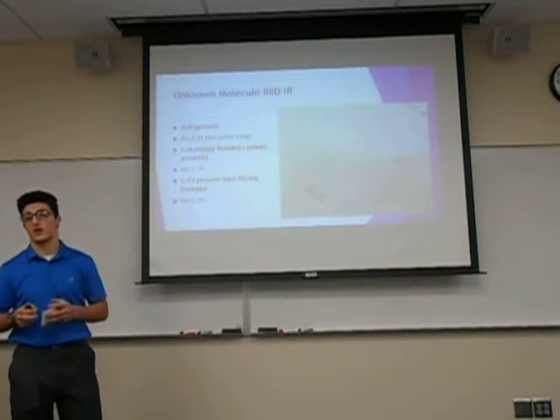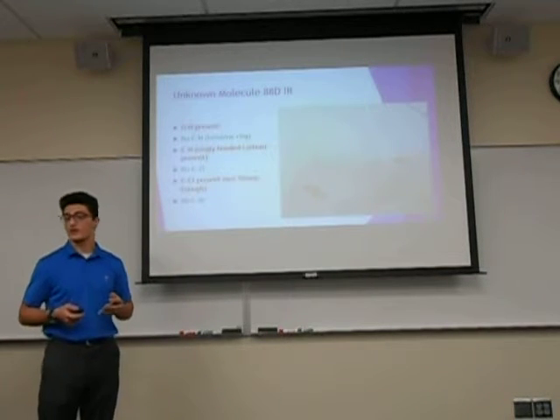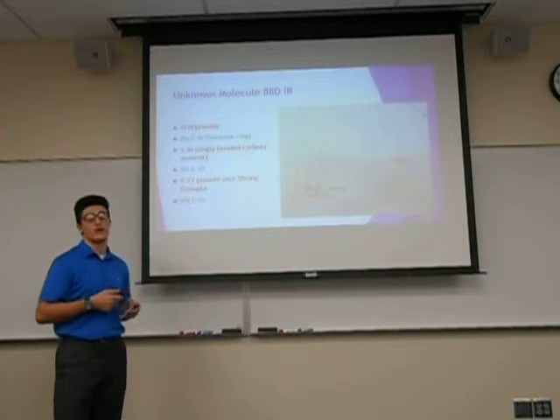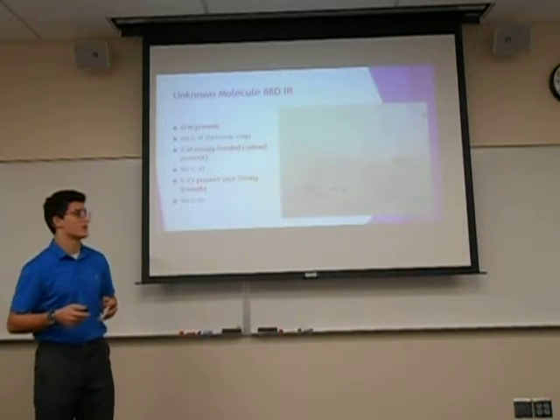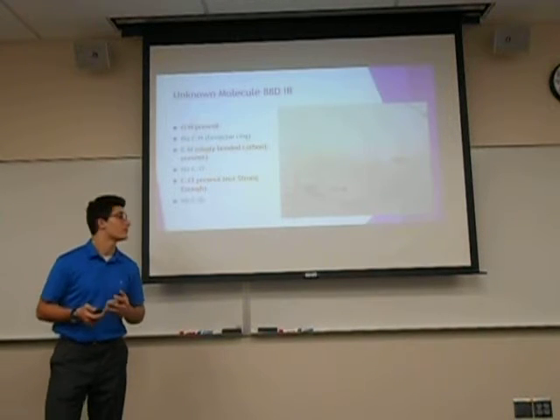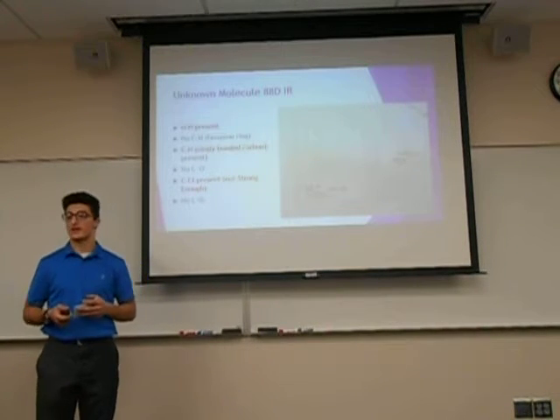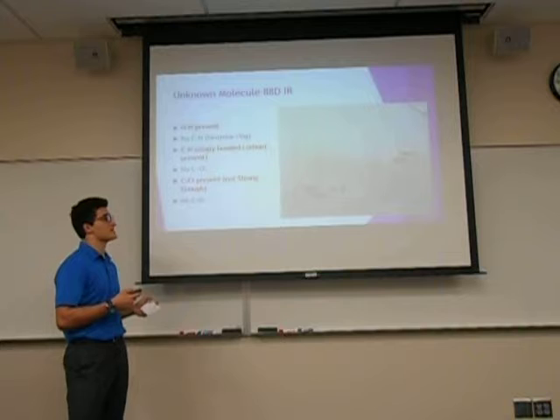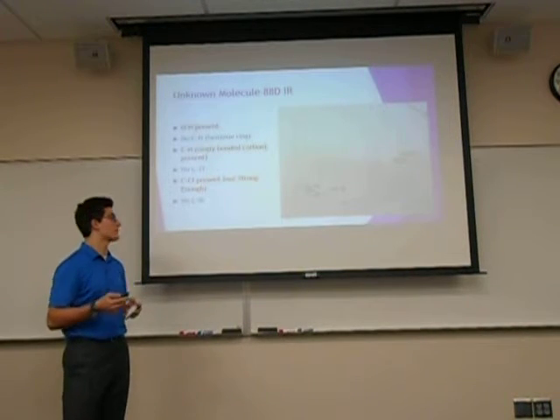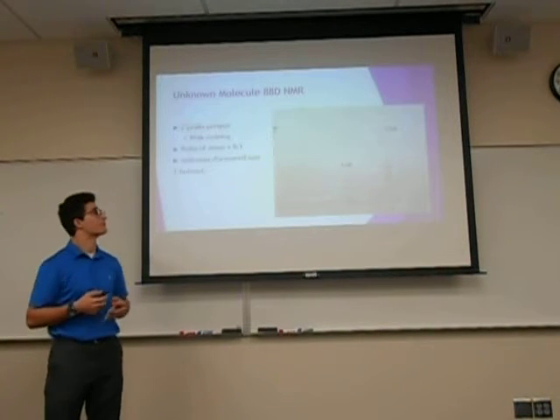There's no benzene ring carbon to hydrogen, but there was a carbon to hydrogen single bonded atom right here to the right. The reading for that was 2,973.46. There's no carbon double bonded to oxygen. There was a C-Cl present. Even though the C-Cl is present, it is not strong enough to be in the absorption range. And there was no C to Br.